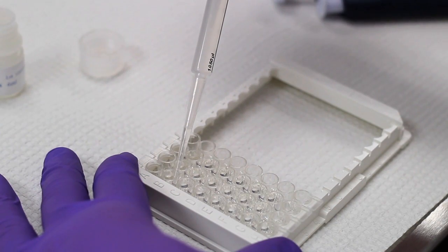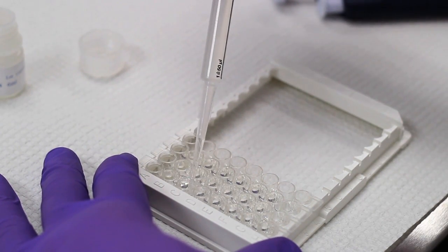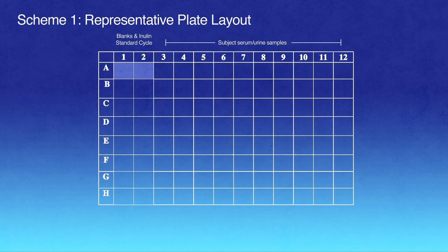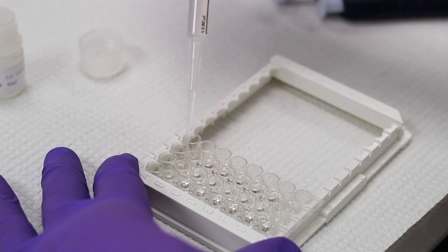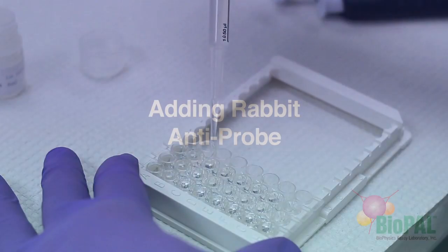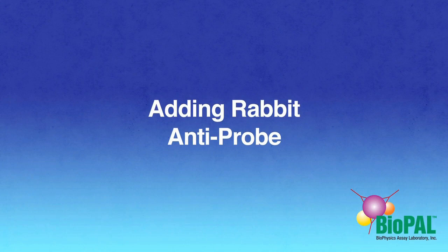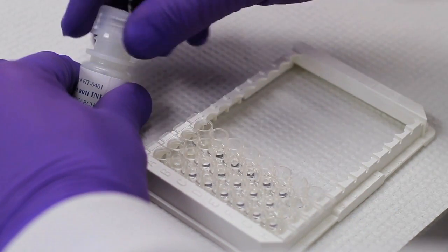After placing the blanks, begin pipetting the standards starting with test tube B. When you have completed plating out all the standards, the first two columns of the plate will be filled. Now begin plating out your samples in duplicate as outlined on your schematic.